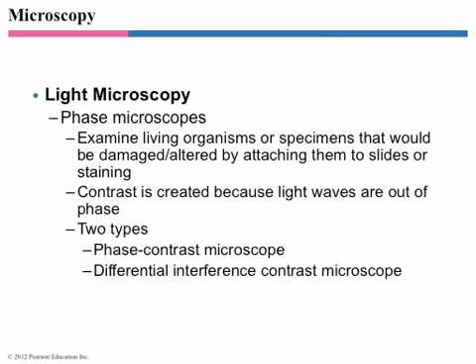Phase microscopes are a little bit of a combination between the two, but they're mostly a type of bright field. They take advantage of the fact that light which moves through a cell, like a bacteria, changes a little bit. And it changes because of refraction, what we talked about before with the bending of the light. Cells bend light differently than water does. So you've got one bit of light that goes through a cell, one bit of light that goes right next to the cell, and they come out slightly different.